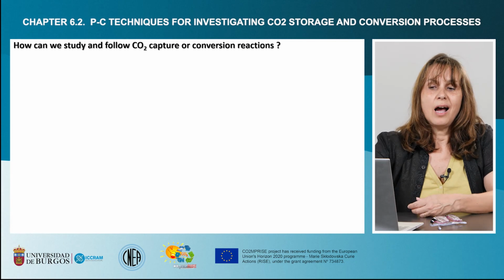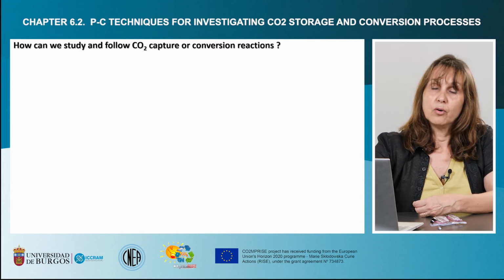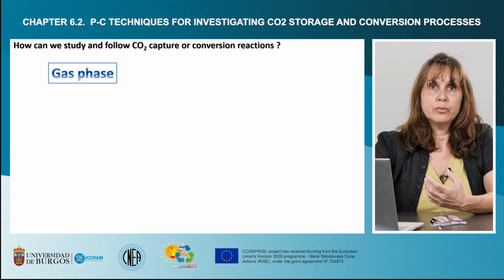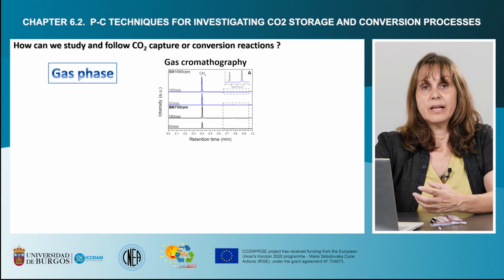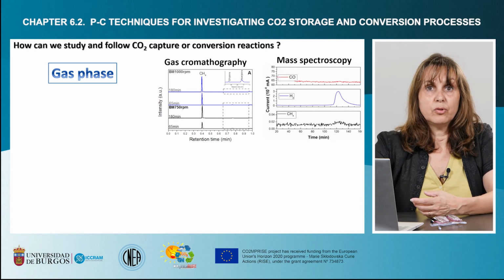The question is, how can we study and follow the carbon dioxide capture and conversion process? Since we have a gas, it's important to follow the change in the gas composition and the formation of different compounds, in particular the desired compound like methane, by, for example, gas chromatography and mass spectroscopy.